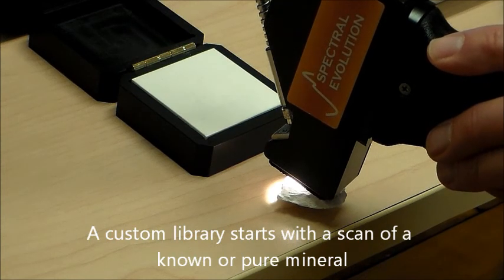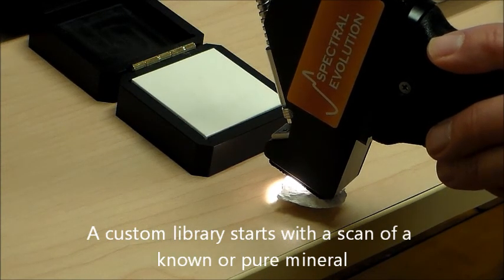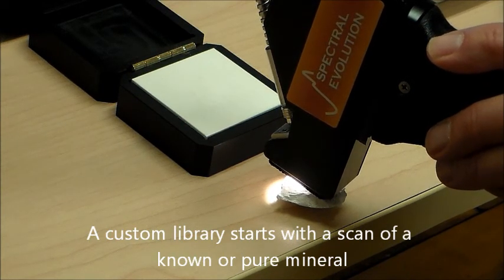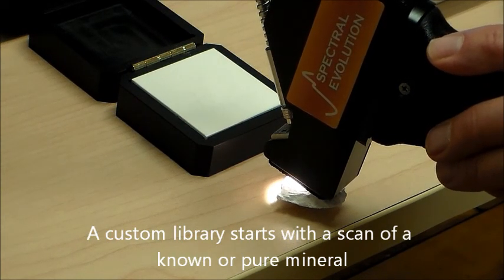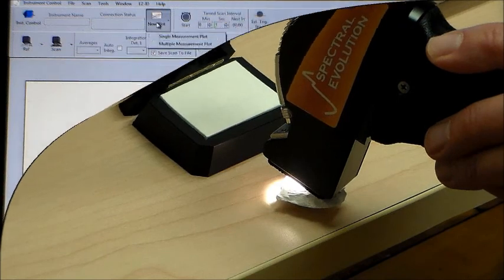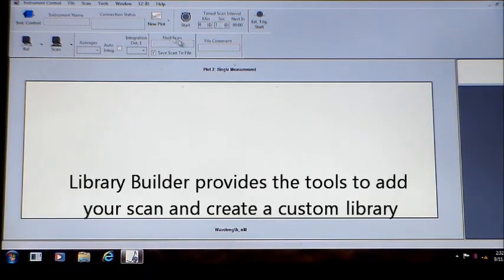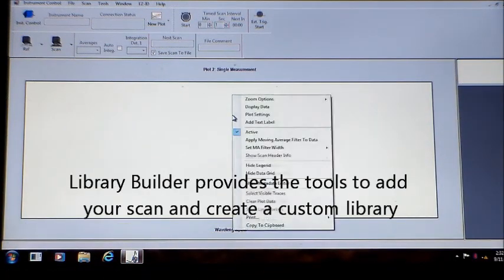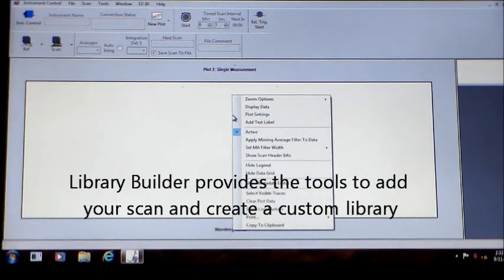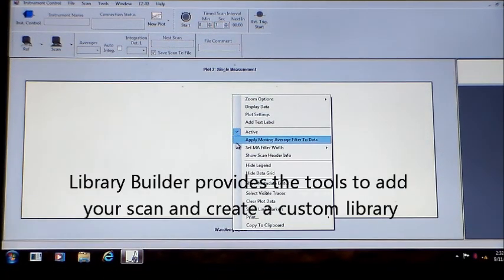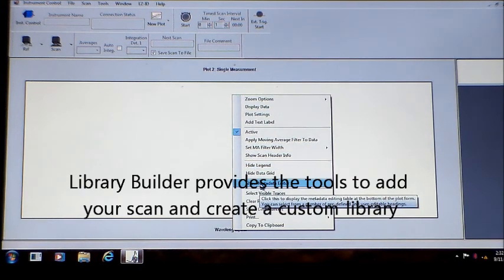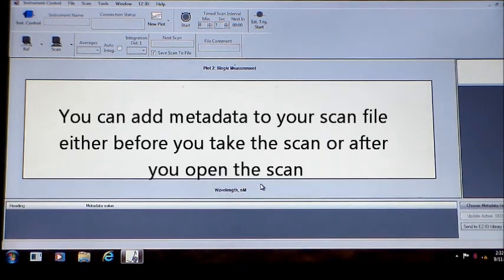Start by scanning a known sample. The Library Builder Module of EasyID gives you the tools to save your scans in a library with metadata. Proceed with your scans and save them.